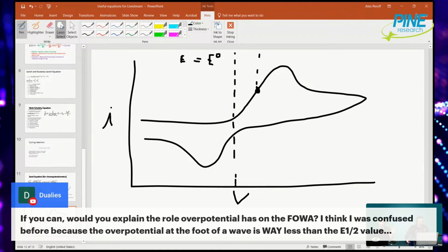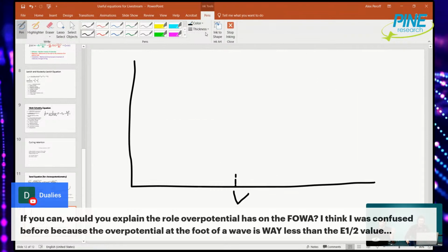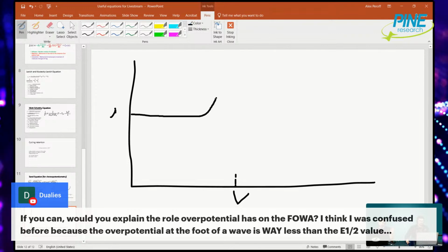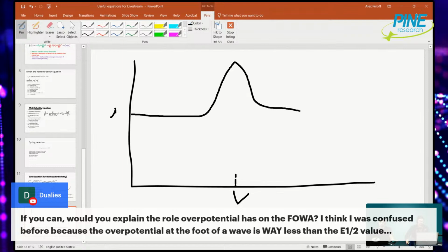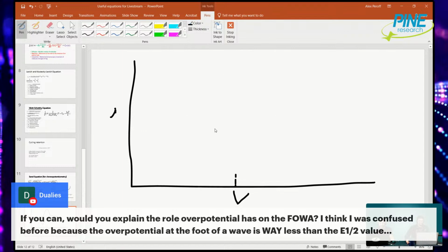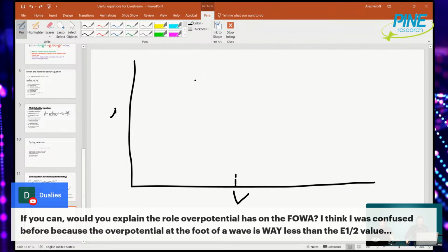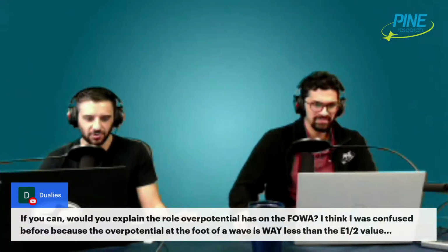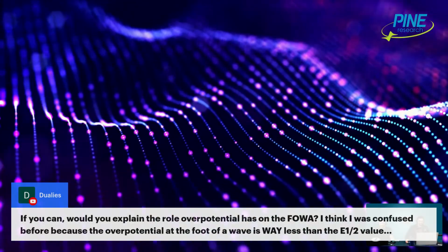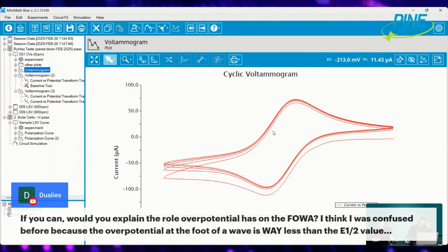So draw a more normal CV without exaggeration. I can draw a regular CV. This is my interpretation of what he's asking. So if you draw a regular looking CV, as regular as I can draw, right? God, so close. I can't actually. Here, I'll do one better. Don't draw, because drawing is hard for both of us. I'll stop sharing. Let me share. Hang on. I got you. I have actual Ruhex CVs right here that are nice and perfect.